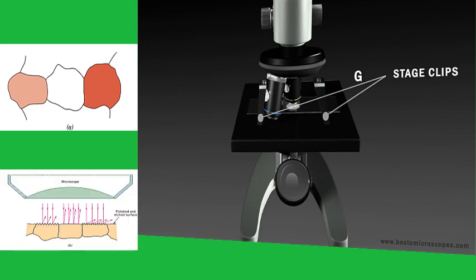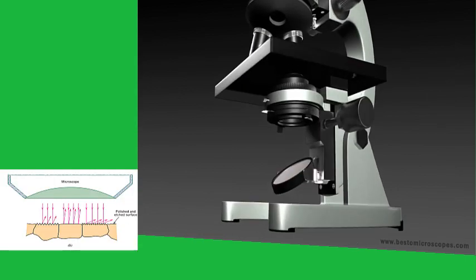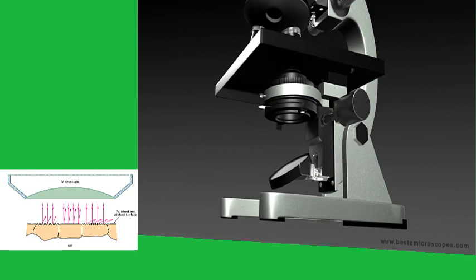Figure B is a photomicrograph of a polycrystalline specimen in which the grain boundary grooves are clearly visible as dark lines. When the microstructure of a two-phase alloy is to be examined, an etchant is often chosen that produces a different texture for each phase so that the different phases may be distinguished from each other.